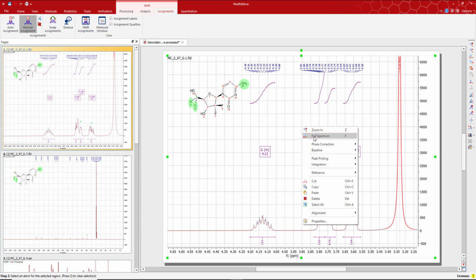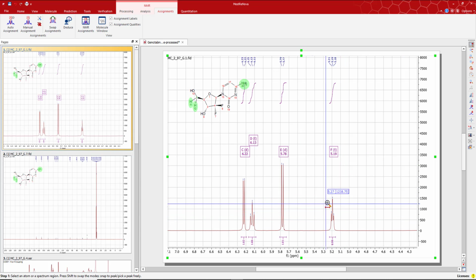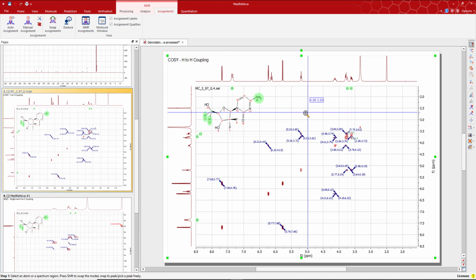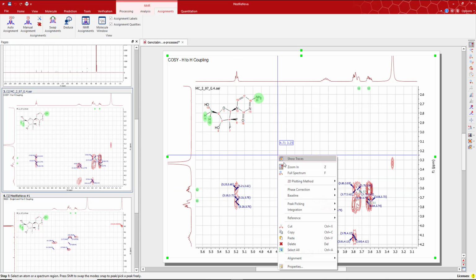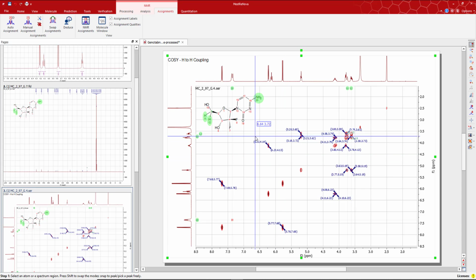So again, we know because we're in dry solvent and we have good couplings that we're pretty sure that this triplet, this OH triplet here at 5.2 ppm is likely this OH number 10, because it should be a triplet from the neighboring diastereotopics. We can go to the COSY to double check that to see, do we see a cross peak from this triplet here over to the diastereotopics? And we do. So if we come down here, we can see that these peaks here are interacting with the OH right there. So that's a nice double confirmation that that proton is exactly what we think it is.